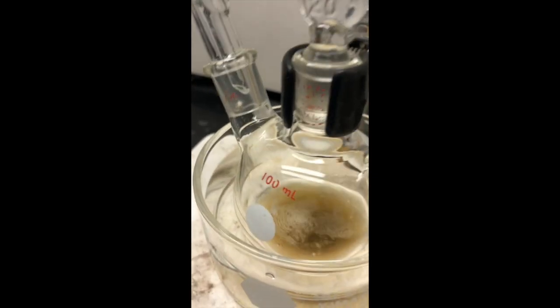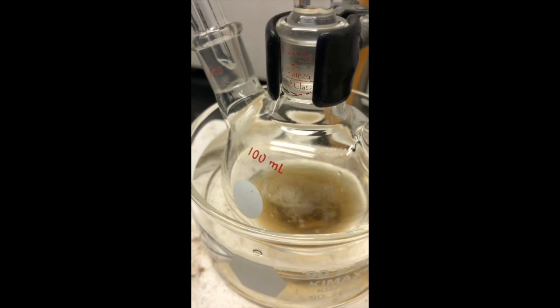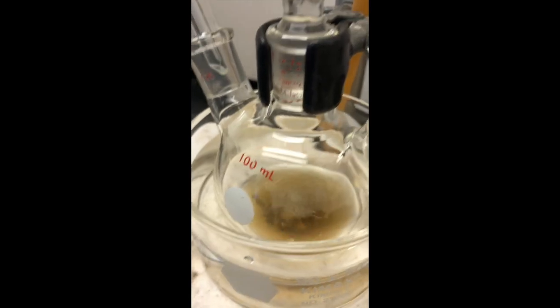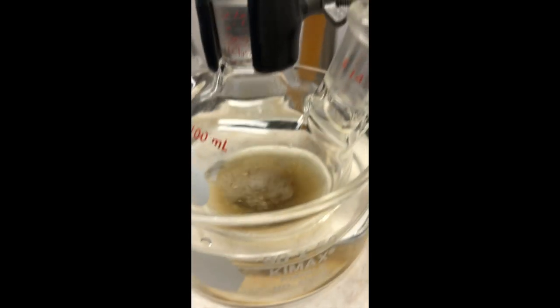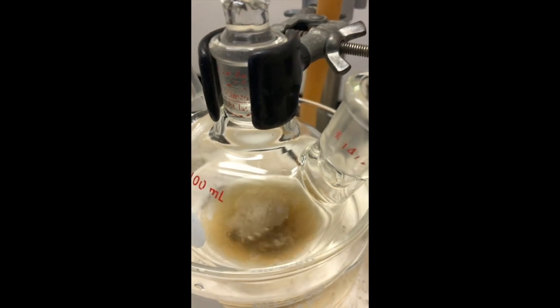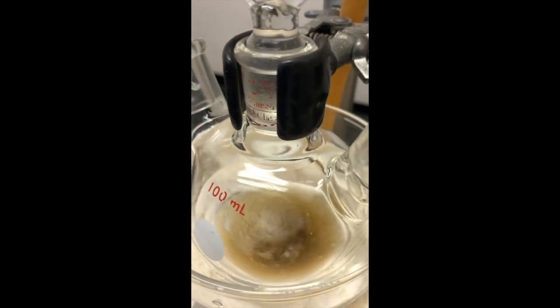For the first part of the formation of the Grignard, we've just lowered the reaction flask down and added a bunch more warm water to the crystallizing dish. And we're going to do an extended reflux period so that we can react as much of that magnesium as possible.